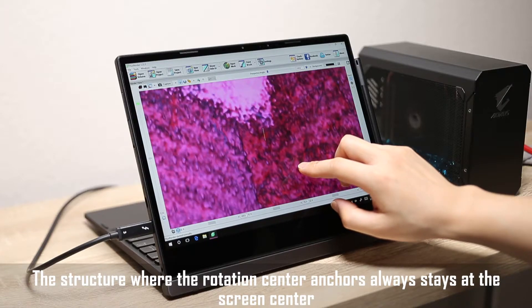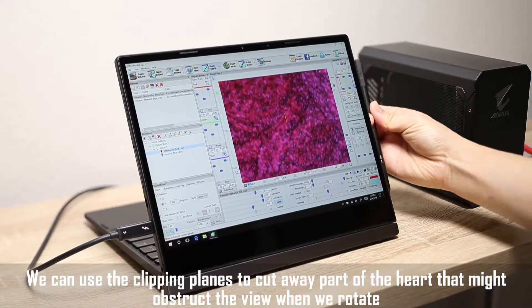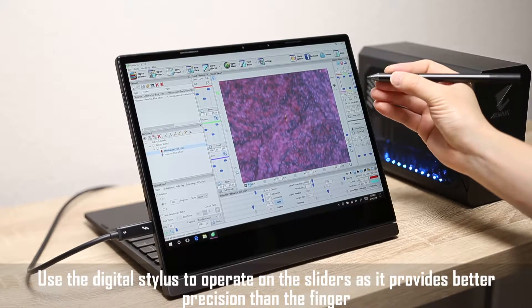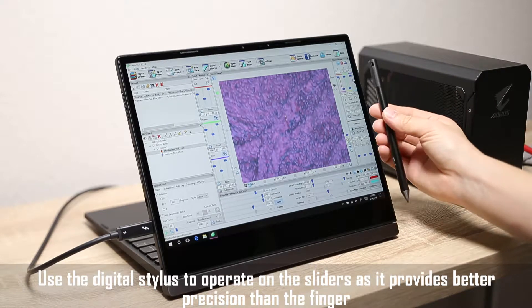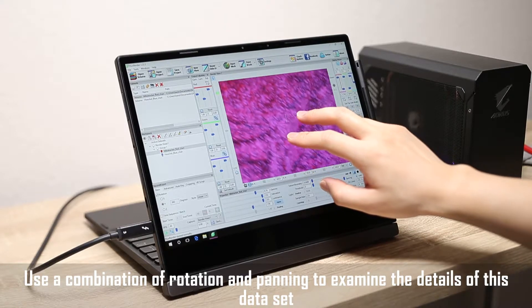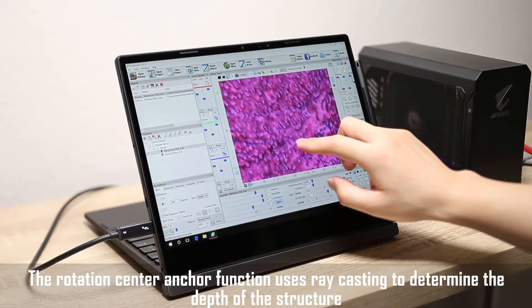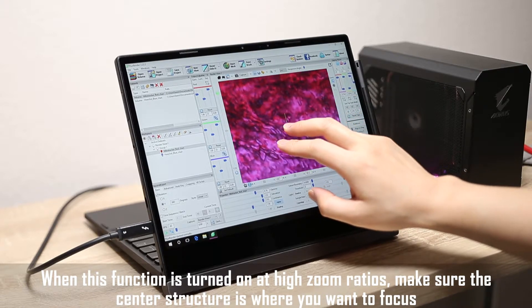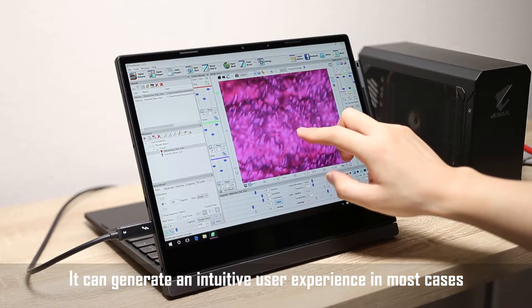The structure where the rotation center anchors always stays at the screen center. We can use the clipping planes to cut away part of the heart that might obstruct the view when we rotate. Use the digital stylus to operate on the sliders, as it provides better precision than the finger. Use a combination of rotation and panning to examine the details of this data set. The rotation center anchor function uses ray casting to determine the depth of the structure. When this function is turned on at high zoom ratios, make sure the center structure is where you want to focus. It can generate an intuitive user experience in most cases.